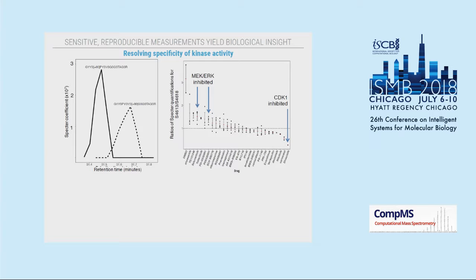And within those 96 samples, we found this particular pair of positional isomers, meaning the same peptide sequence, but phosphorylated at different serine residues within the sequence. Both of them were identifiable in the vast majority, something like 88 out of those 96 samples. So that's the reproducibility. But it's also exploiting the sensitivity, because these positional isomers are really hard to distinguish in DIA. Their spectra are very similar, their sequences are similar, and as you can see here, they nearly coelute in most of these conditions.